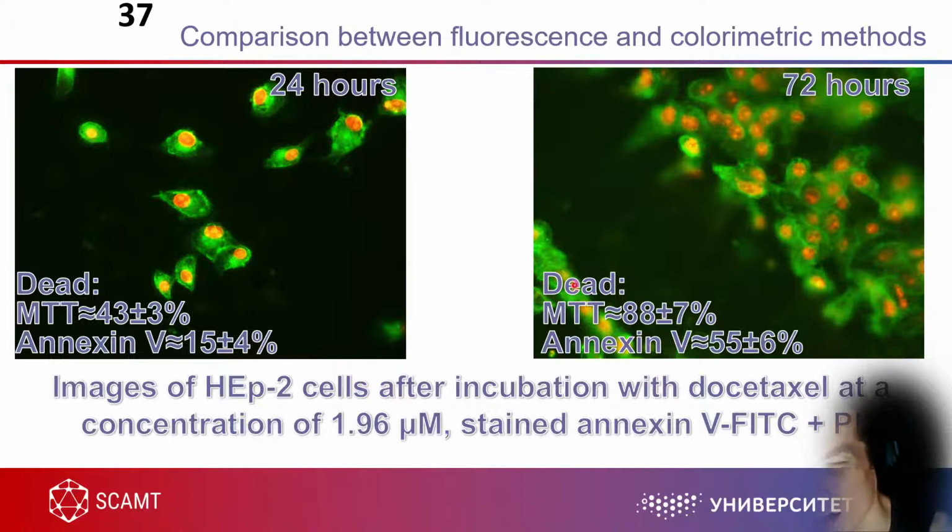So it's just not dead, it's just a decrease in viability. It can be either that 90% of cells are dead and 10% survived, or every cell survived, but they are living at only 10% each. So you can't even tell what happened to your cells.